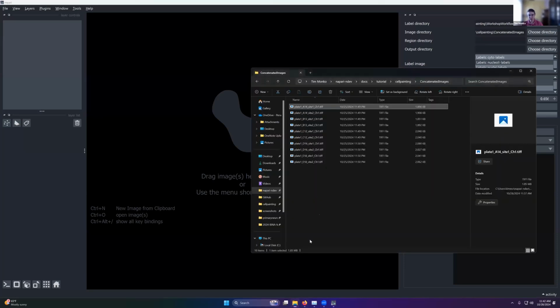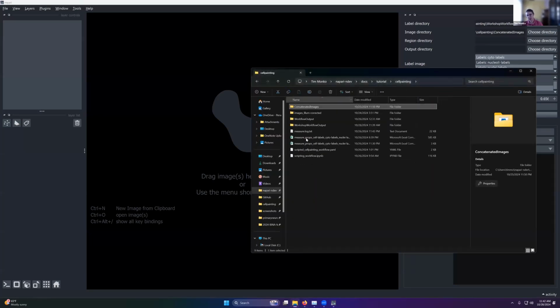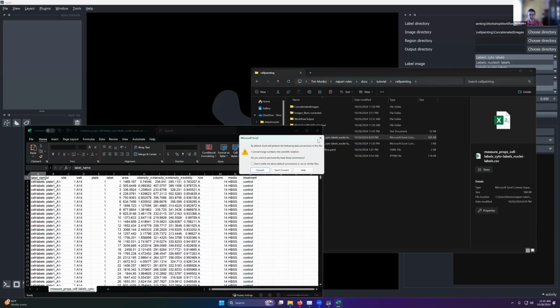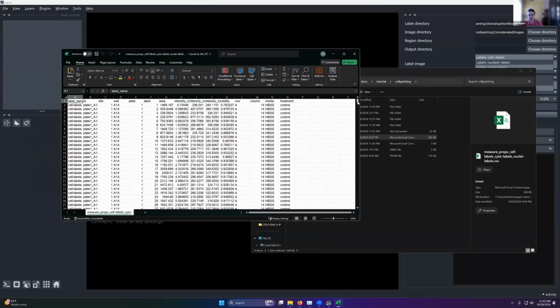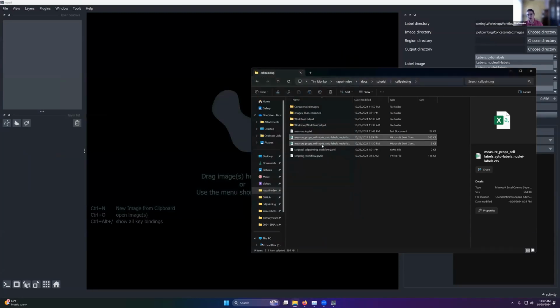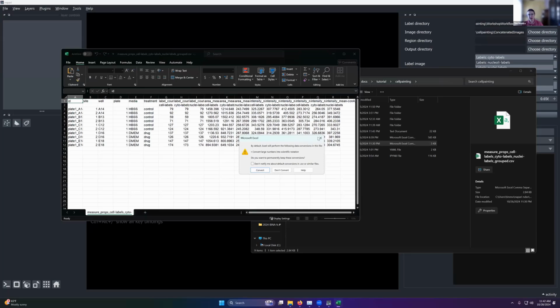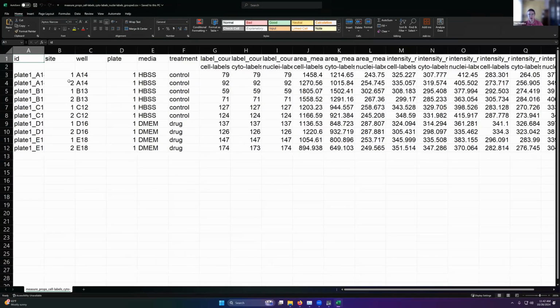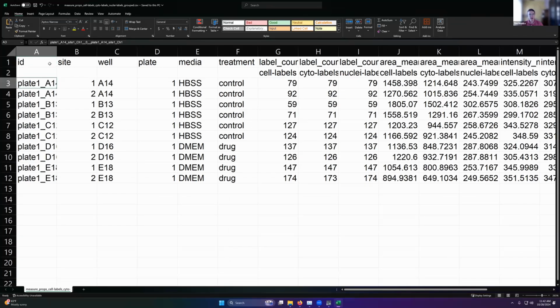So what that data set will look like, and what I mean by it's very large, this is already, I have no idea, 3,400 rows. But if we group that data, here's those 10 images and all of the various data that we want from it. So this is kind of our name of our thing.